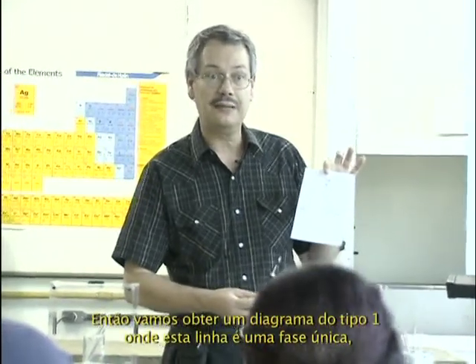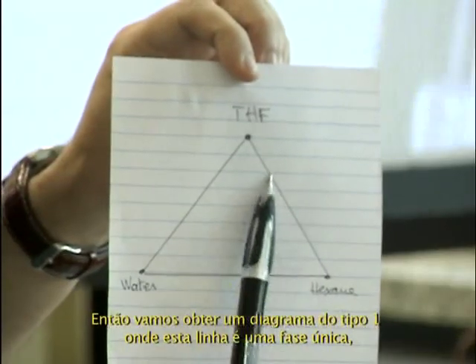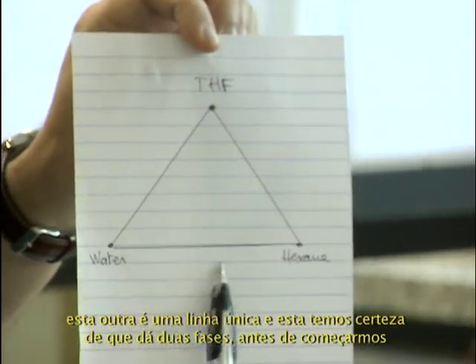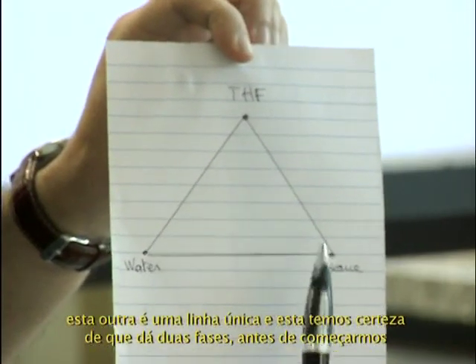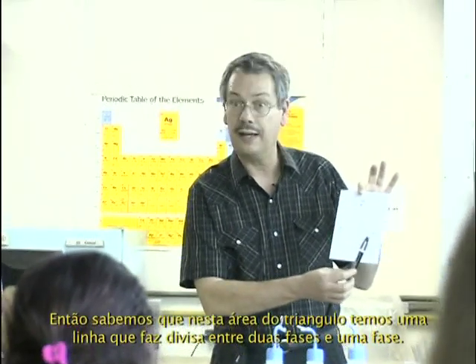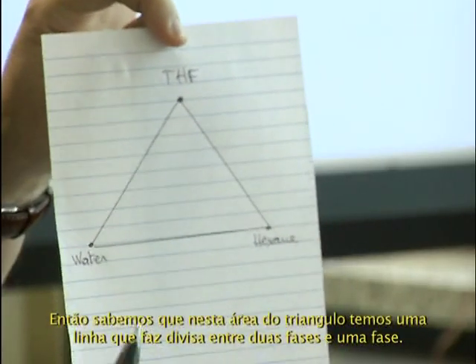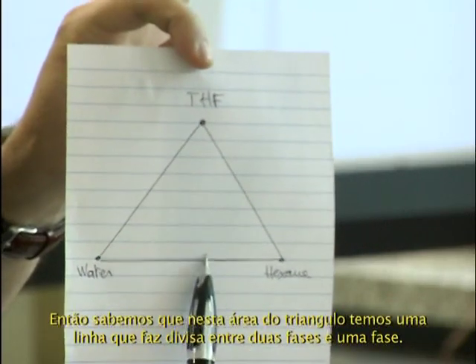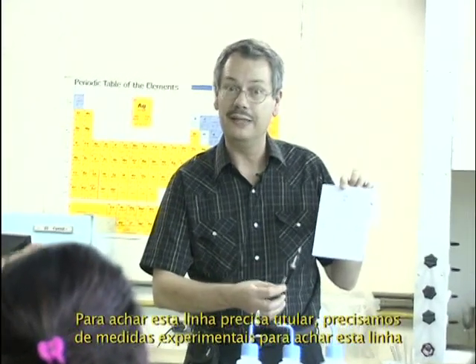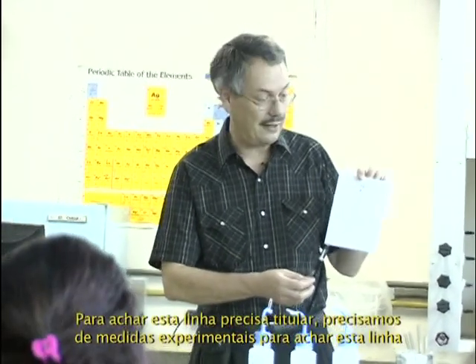So we will obtain a type 1 diagram, which means this is a single phase, we are sure. This line is a single phase, we are sure also. And that line is two phases. We are also sure before starting. So we know that in this triangle area, we have some line that will make a boundary between two phases and one phase. Where is that line? To find that line, we need titration.